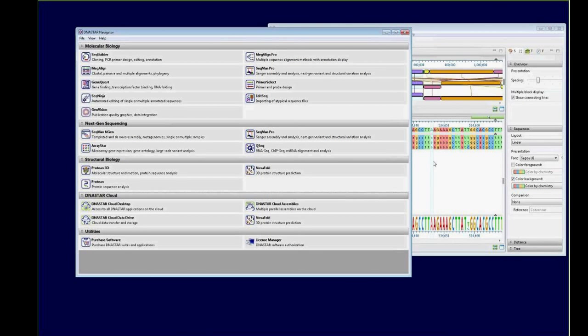Yeah, and Katie, we have just a couple of questions here, if we have time to get to a few of them. One of them, definitely: what do the numbers at the nodes of the phylogenetic tree represent?